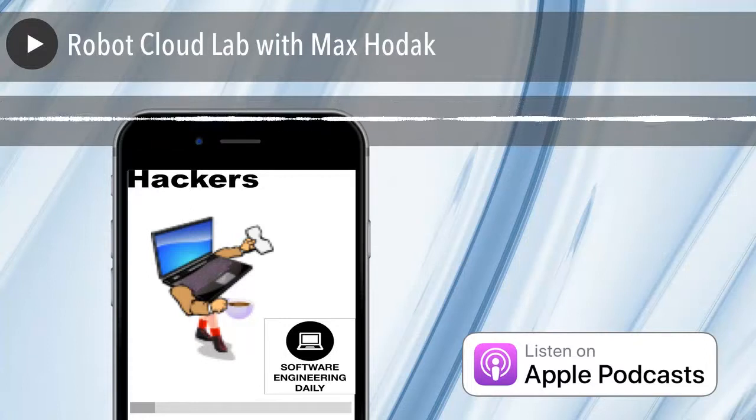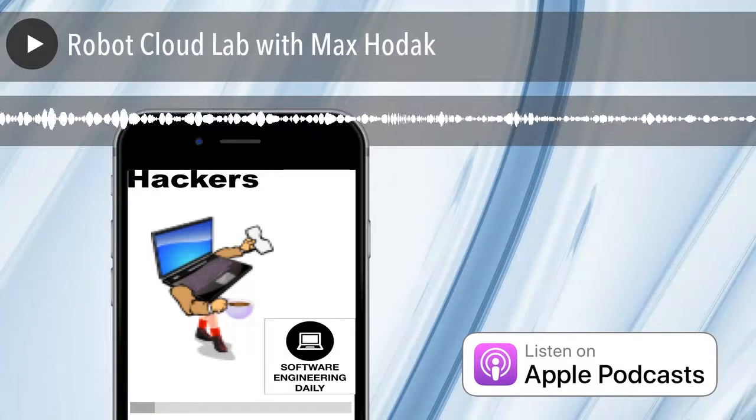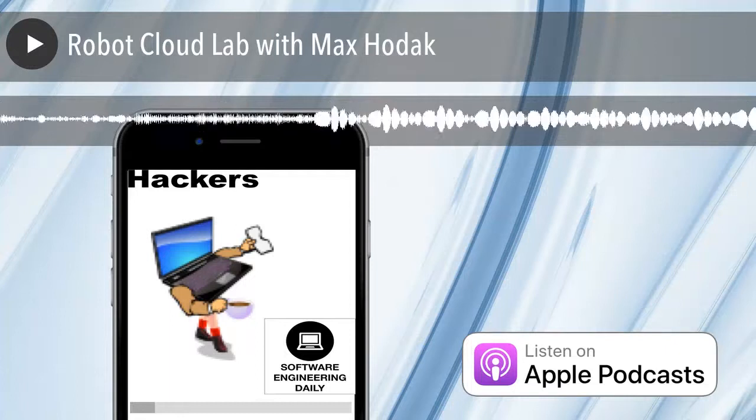So we bought a centrifuge at one point, and we'll build a lot of devices, but we decided that a centrifuge wasn't going to be one of them just for safety reasons.